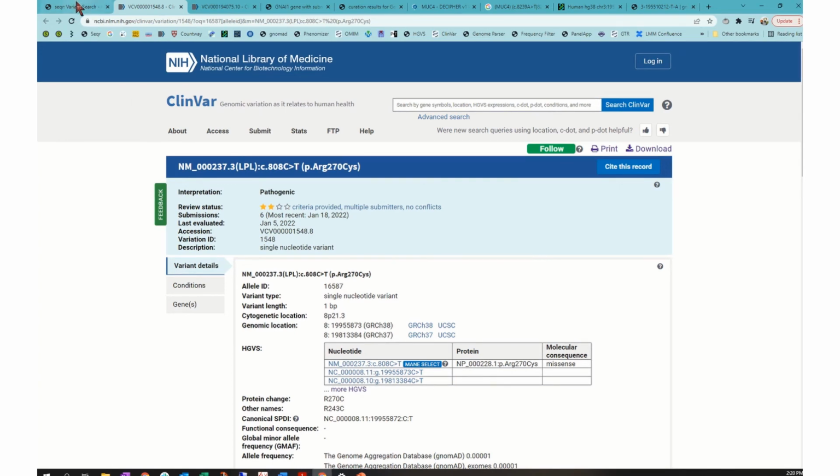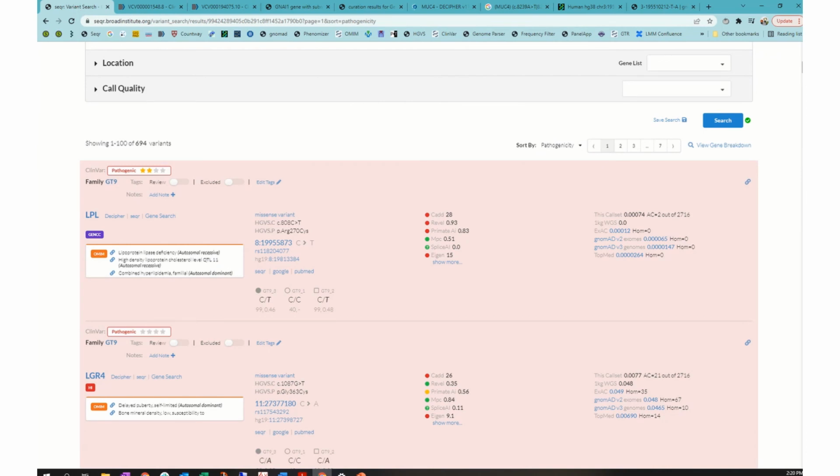So when thinking about this particular variant, I'd want to evaluate the gene-disease relationship. Looking at both OMIM and GenCC here, it seems the gene is primarily associated with a hyperlipidemia type phenotype. That's not something I'm particularly interested in with respect to the proband we're looking at, who has more of a neurodevelopmental phenotype. However, if you evaluate the pathogenicity of this variant and consider it pathogenic, you might decide to return this variant depending on your incidental findings policy.